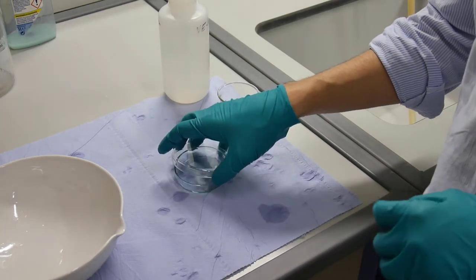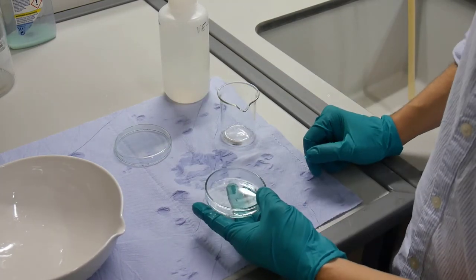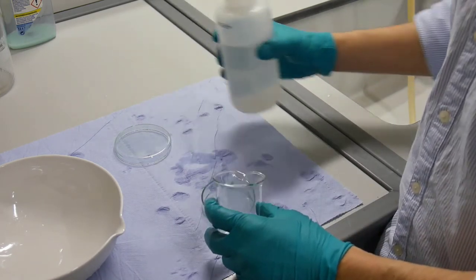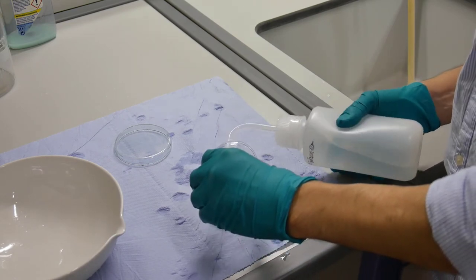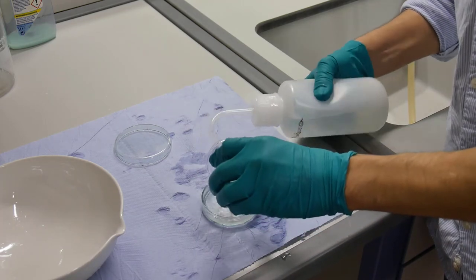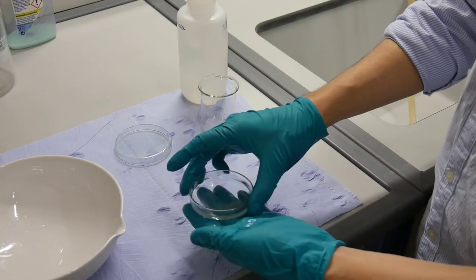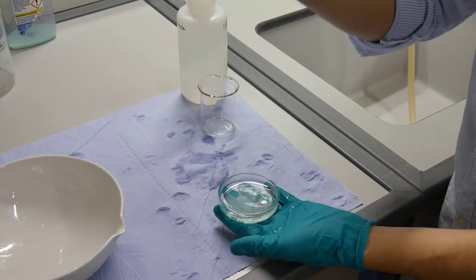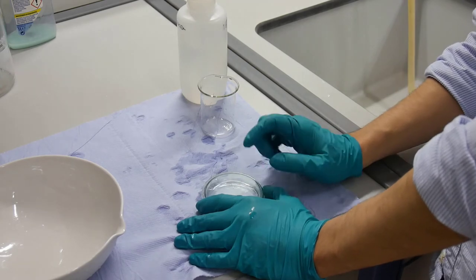To look for the minerals in the binocular microscope, we usually use petri dishes. I would suggest transferring the sample here in the lab already, just to avoid any accidents in the microscope lab. So I'm washing all the heavy minerals from the small beaker and now they are all inside the petri dish. We have a lid and this is a good moment to write the name of your sample.